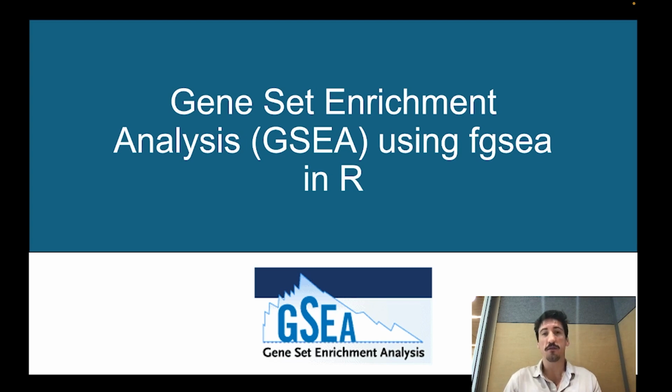If you haven't watched the first video in our series, be sure to check it out for a solid foundation on RNA-seq analysis basics using DE-seq2. We're actually continuing on the same code that we used in that video, so if you haven't seen it, go check it out and then come back to this video. Otherwise, let's get started and explore GSEA.